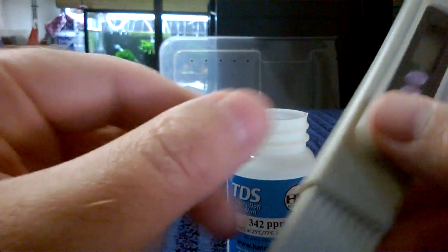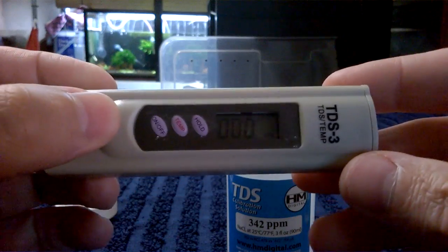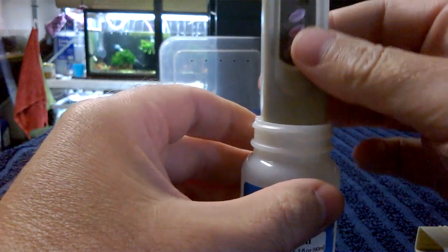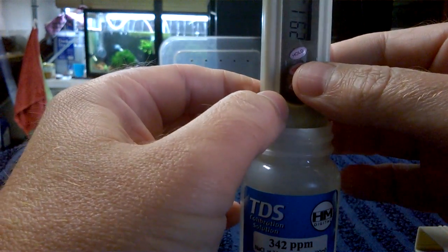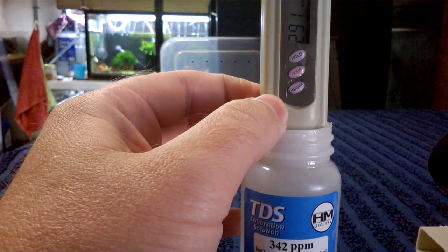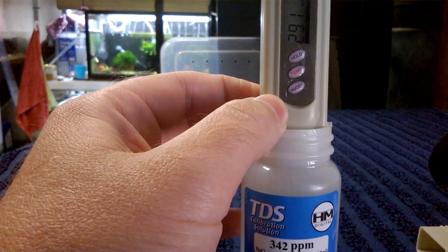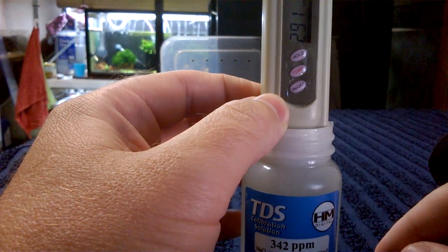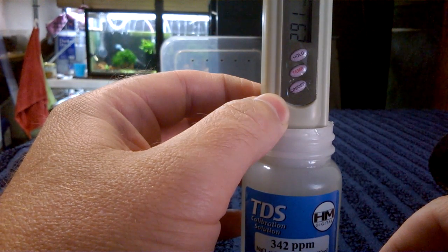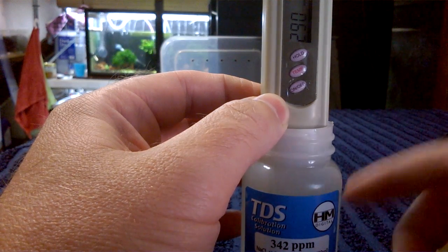Anyway, let's try and calibrate this one. Into the fluid we go, same again up to the little neck. It reads 291. So this TDS meter is 51 points out. TDS meters are normally guaranteed to be only one to two points out at most, so I thought maybe it just needs calibrating.